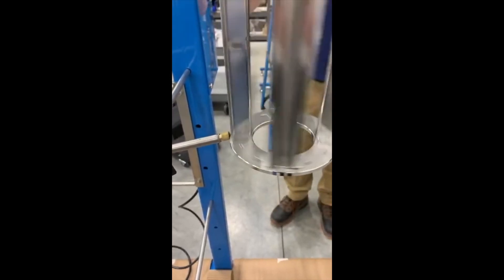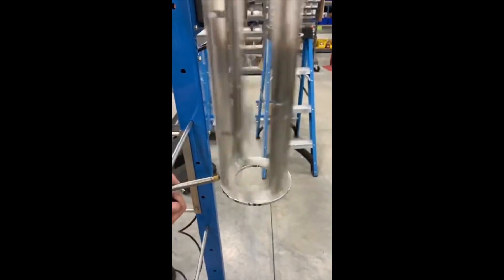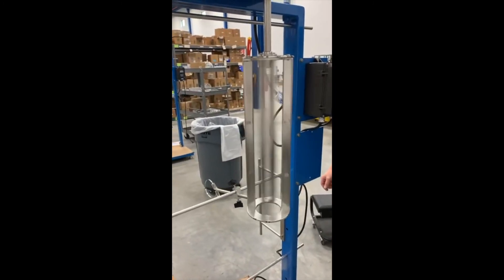You want to first spin it slow to ensure that you don't see much runout, and once you've found that there's not too much runout you'll increase the speed on the wiper retainer — obviously being careful that you stay out of its way because it could cause injury if you get your hand in there. At full speed, if you do not see any excessive runout or hear any excessive vibration or noise, you now have a balanced wiper retainer.